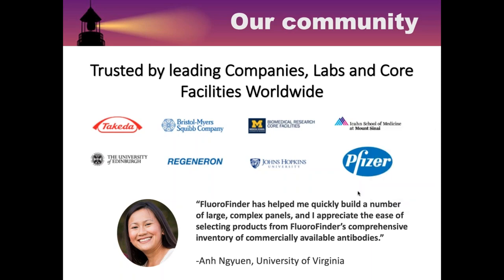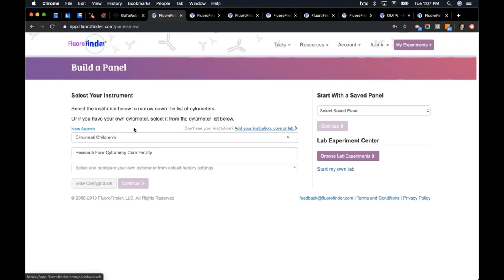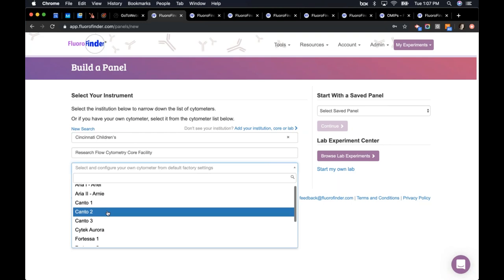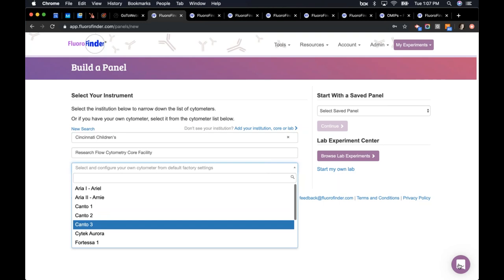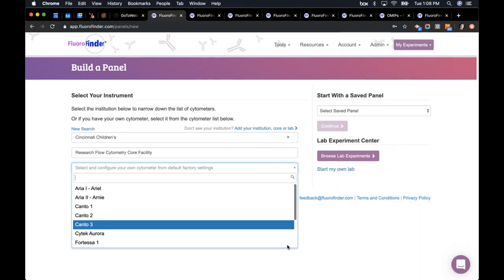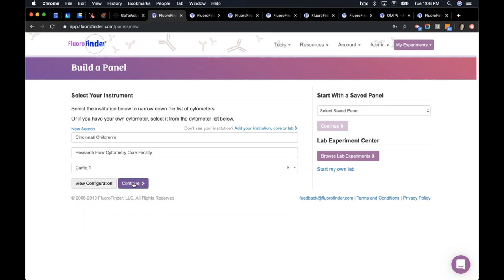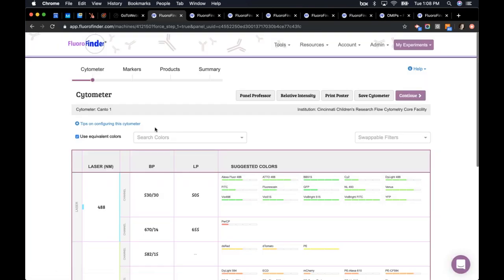I'm going to jump right to the FluoroFinder website. This is our main website, and today we're going to be spending all of our time on the panel builder. The first thing to do is enter your institution and your flow core facility or lab, and then we should have your cytometer configurations already entered into our system. You find your cytometer and enter it. If it's not already in there, you can email us at support@fluorofinder.com or use the chat feature in the bottom right corner.